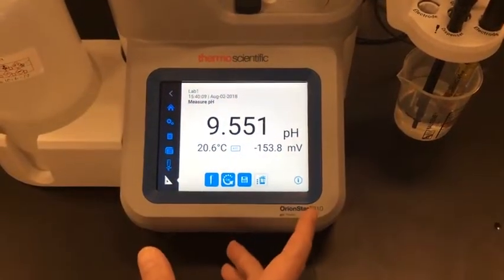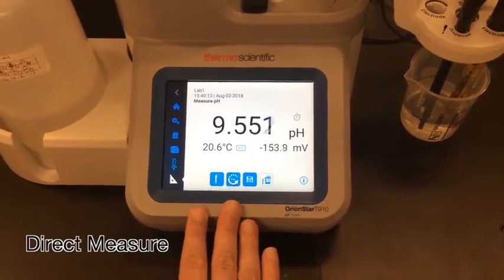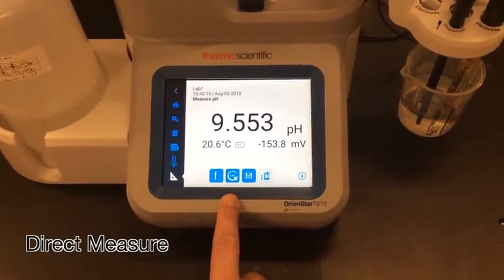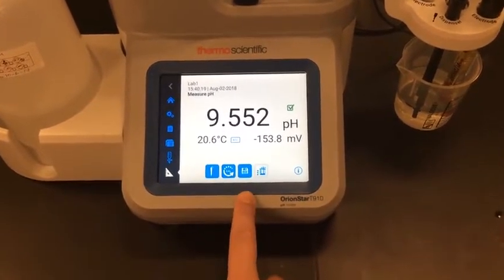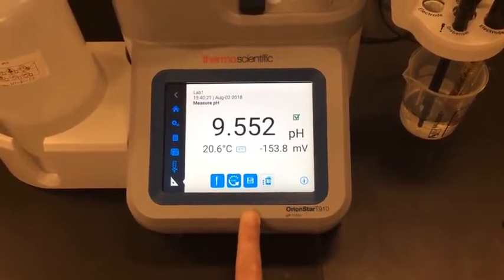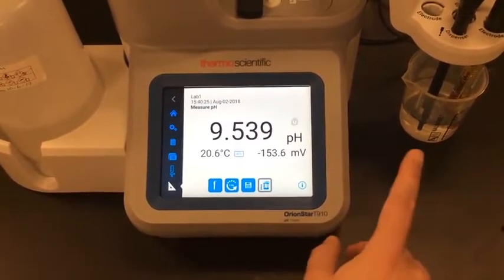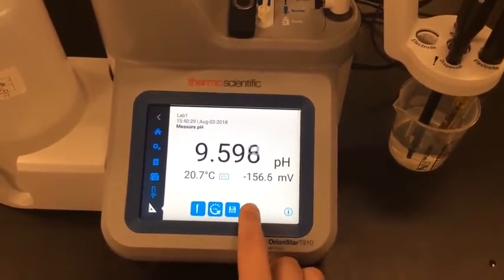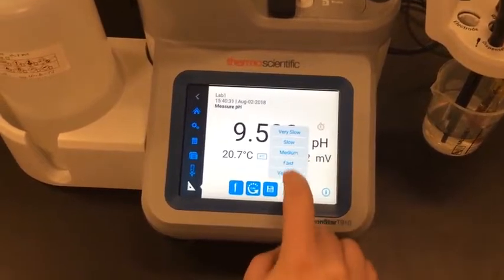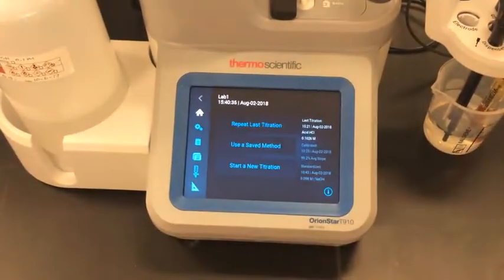The last screen is the direct measure screen. So if I want to take a quick pH reading of my sample before I do my titration, I can do so in this screen. I can also perform my electrode calibration, save my direct measurement in case it's important for my titration results, or I can start and stop the stirring probe. And in case my stirring probe is not doing the speed I want it to, I can press and hold this button and adjust the speed right from the screen.